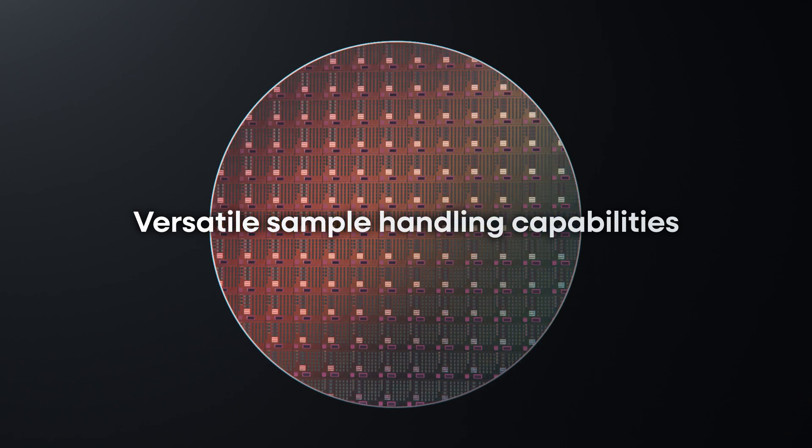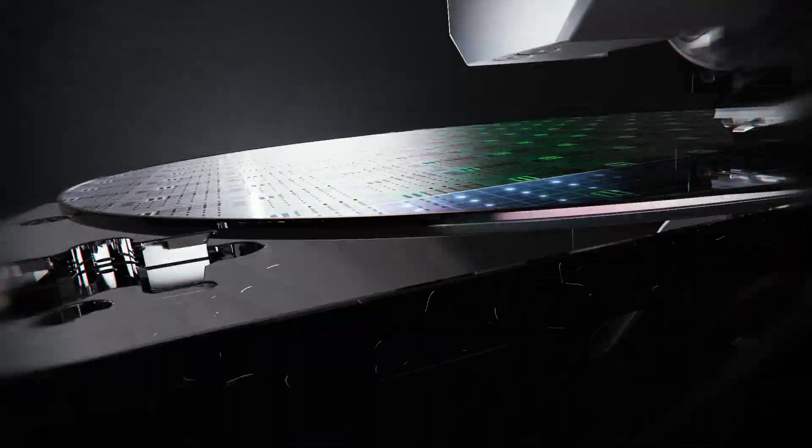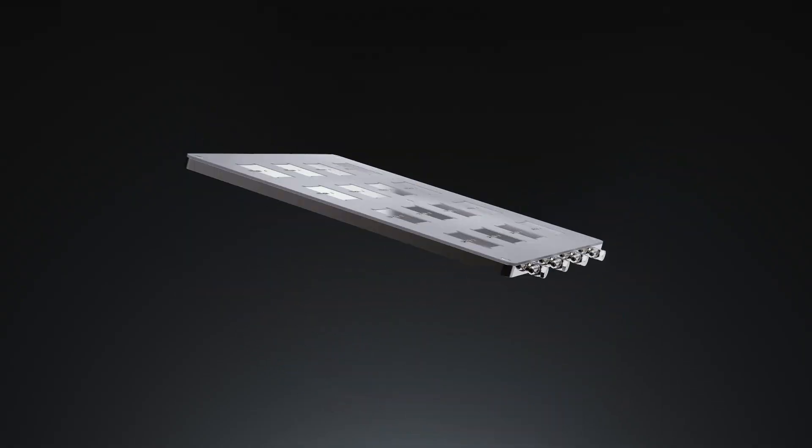The FX200's versatility makes it ideal for both research and industrial applications, accommodating full 200mm wafers or an array of up to 16 small samples.